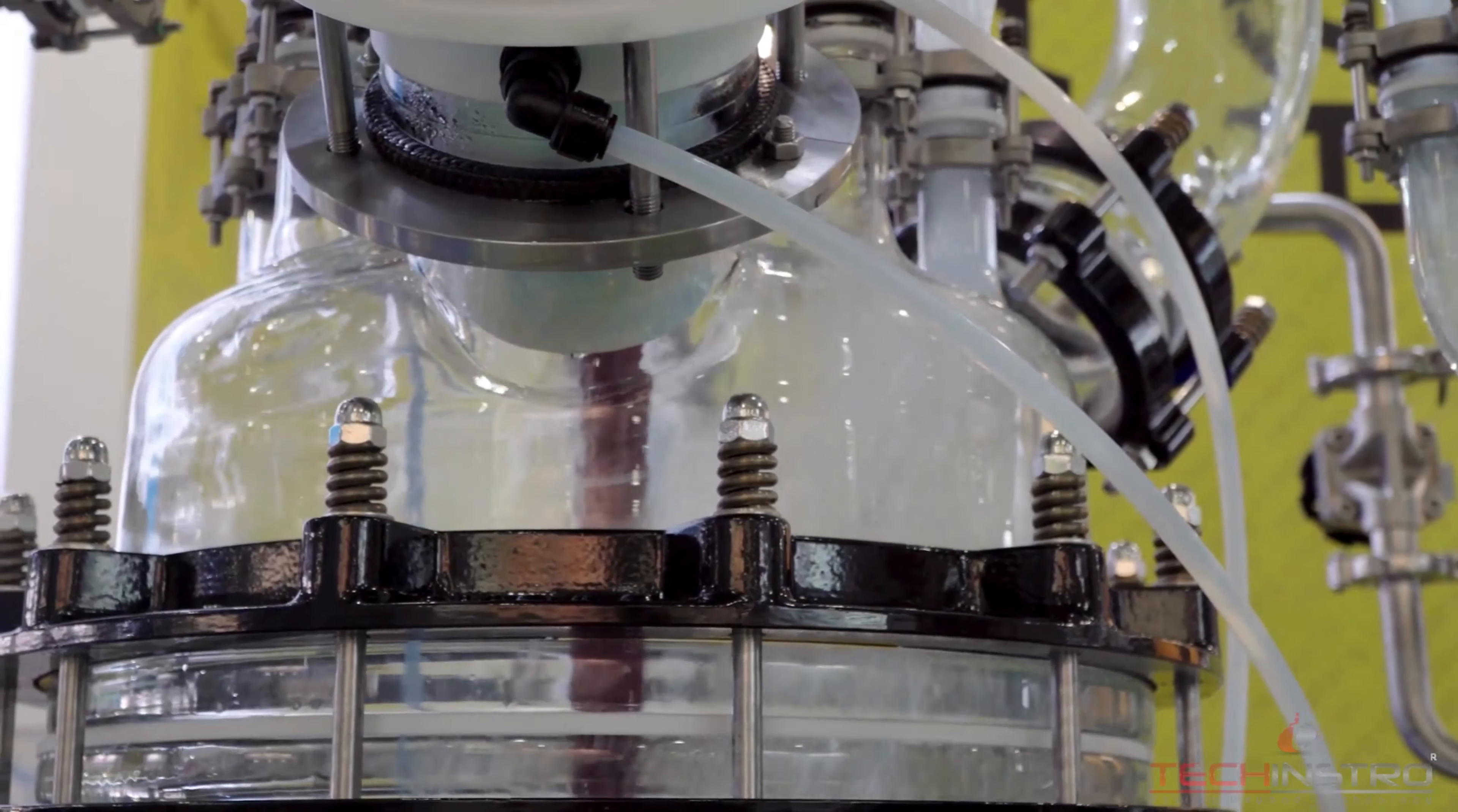After the reaction is complete, the autoclave reactor may be cooled down gradually to allow for safe handling and extraction of the reaction products. The pressure within the autoclave reactor is safely released and the reactor is opened. The reaction products are then extracted for further processing or analysis.